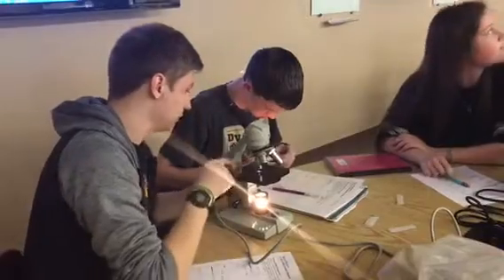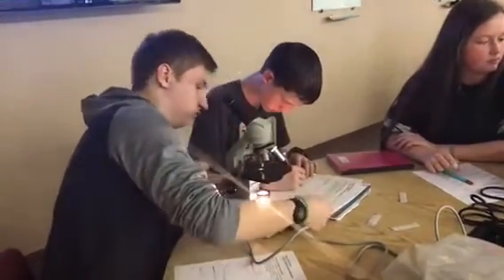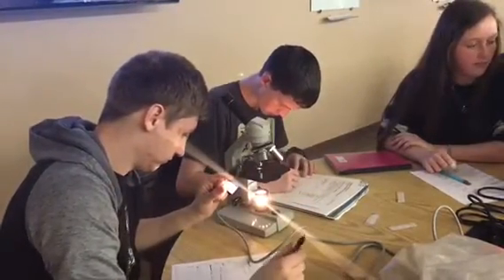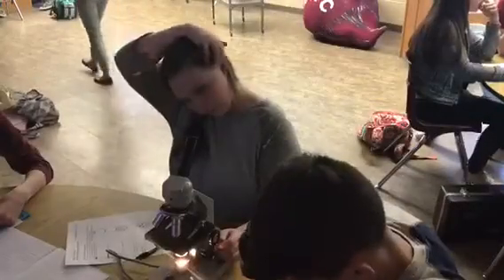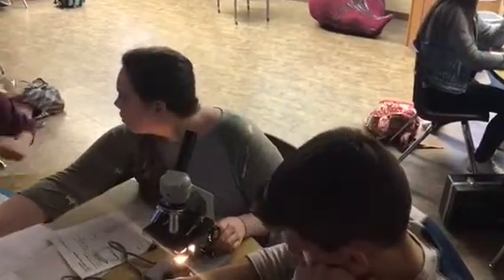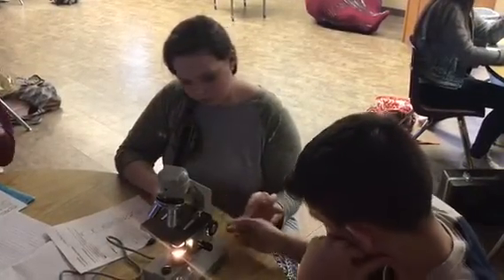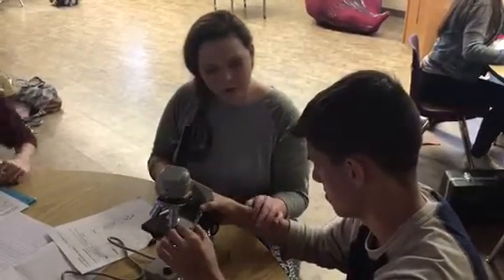And if you use the fine adjustment, make it... See it better now? Yeah. It's like transparent to the middle, so look. Yeah. It's really cool. Do you guys have 1 or 3? 1 or 3 that they're finished. I have a 3. Oh, we have it. There's a 5. We have to describe it.